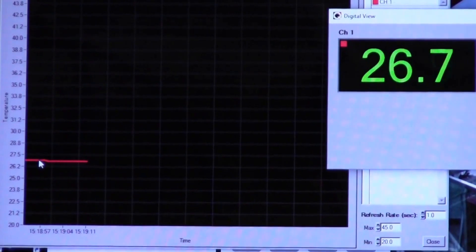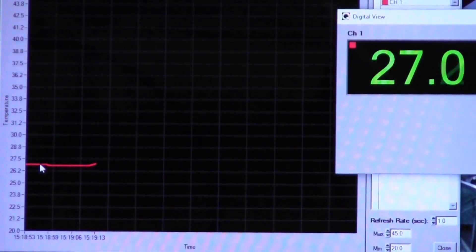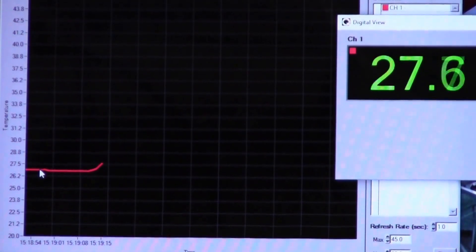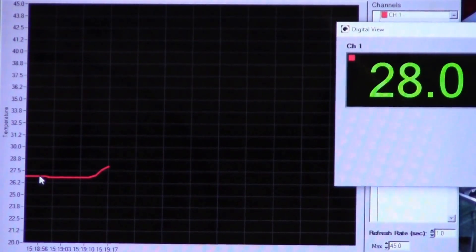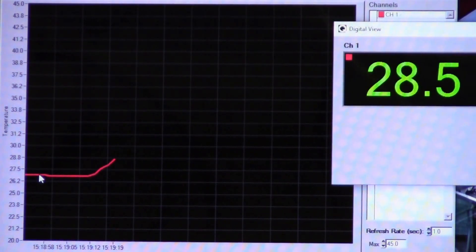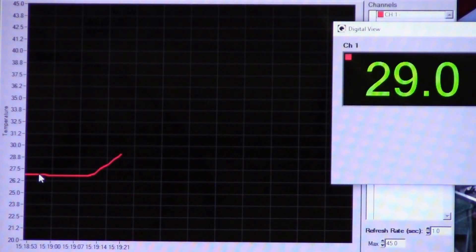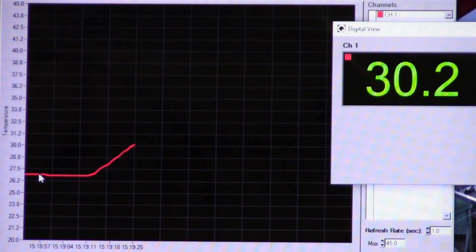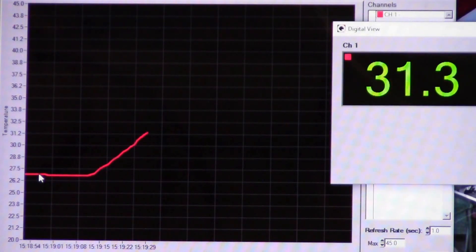Power's up, and you can see it's starting to climb pretty fast because it's starting at a lower temperature. And remember, we're going to be looking for the temperature profile to flatten out as it gets to 35 degrees centigrade.